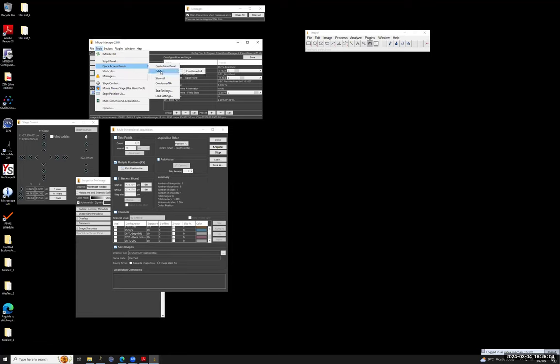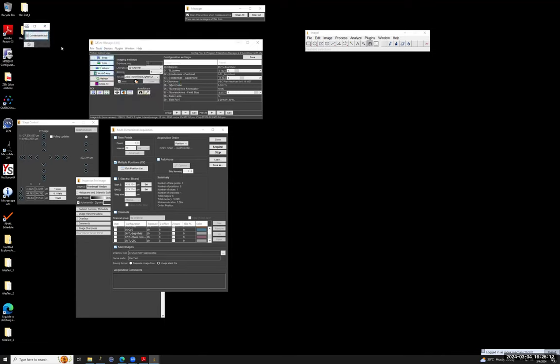So that would be an inconvenience. So in the tools, in the script panel, I can call my BeanShell script called condenser NA. And it's very simple. So it's just here I will set the condenser NA. For example, my 5x objective has NA 0.16, so I would want to set it to 0.13. That's it. Very simple utility. So I'll just show it as an example where the features in Micromanager as such are not so convenient. One can work around it sometimes with such simple scripts.